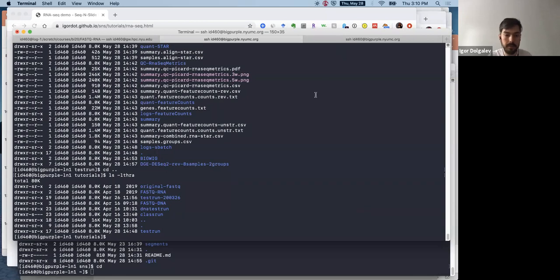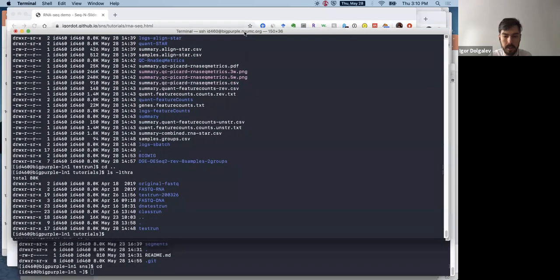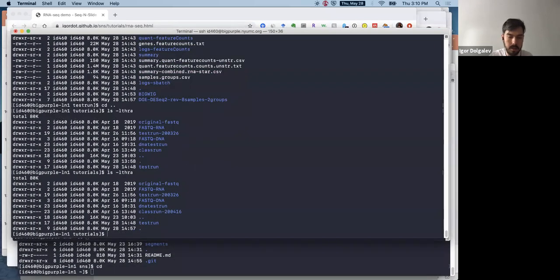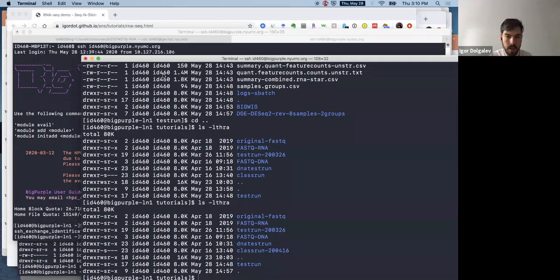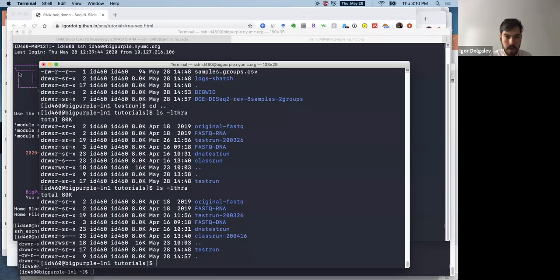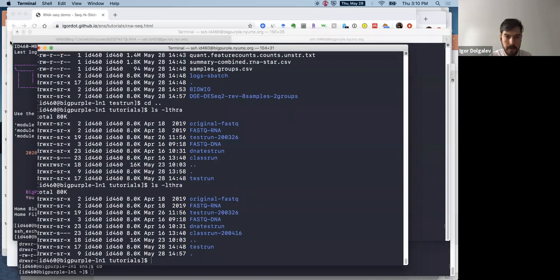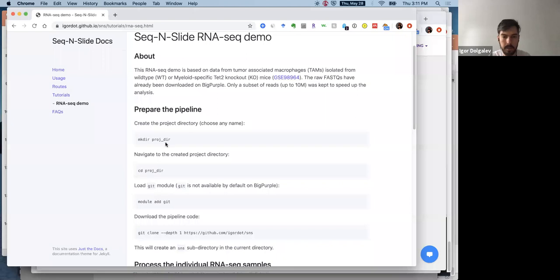I'll make it. I will zoom in here. Hopefully this is good enough to see for everybody.